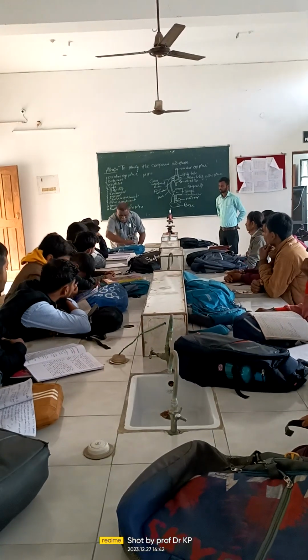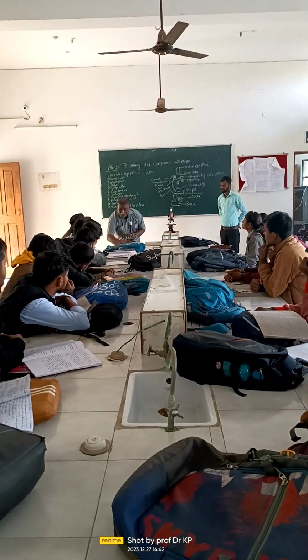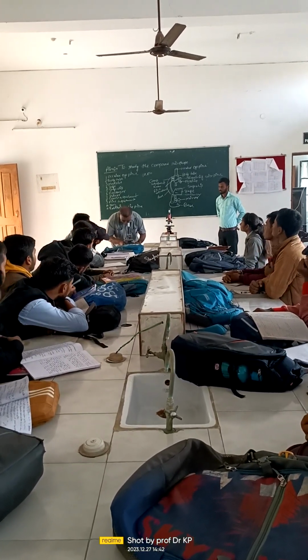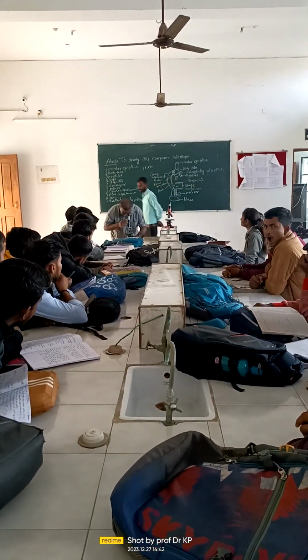Or if you want more amount of light, you can open the diaphragm. The diaphragm now is here. You can open and close the diaphragm. Then after placing the mirror towards the light source, if you are able to see the light, then you are ready for focusing.